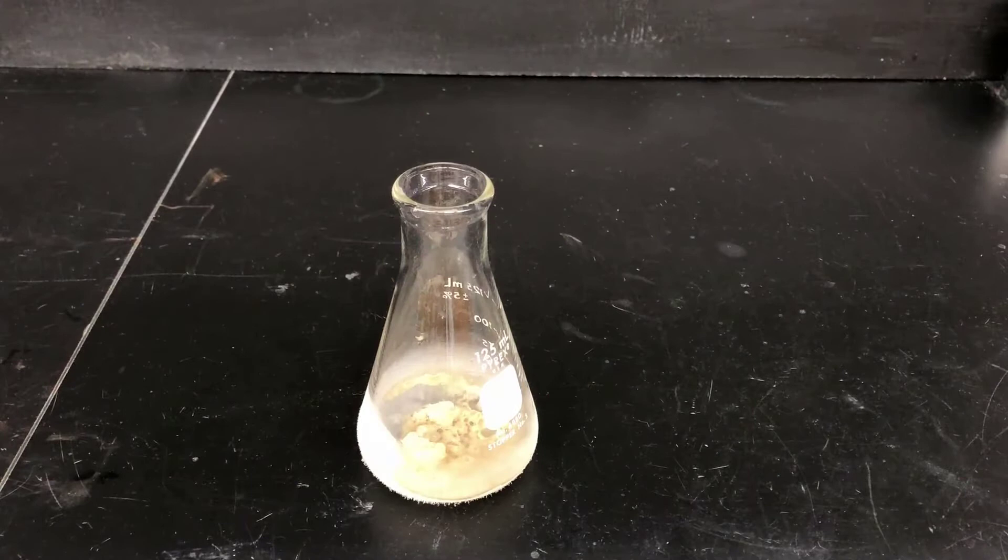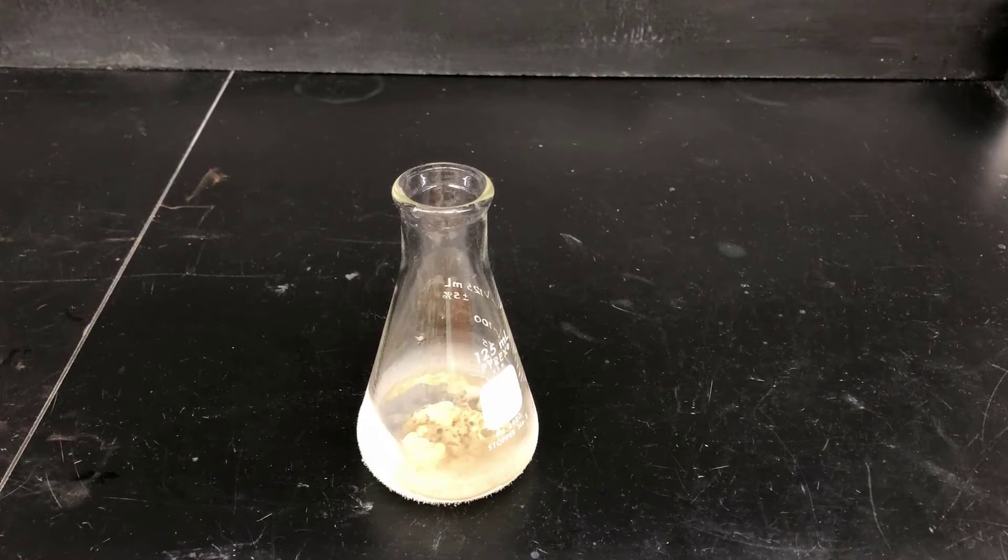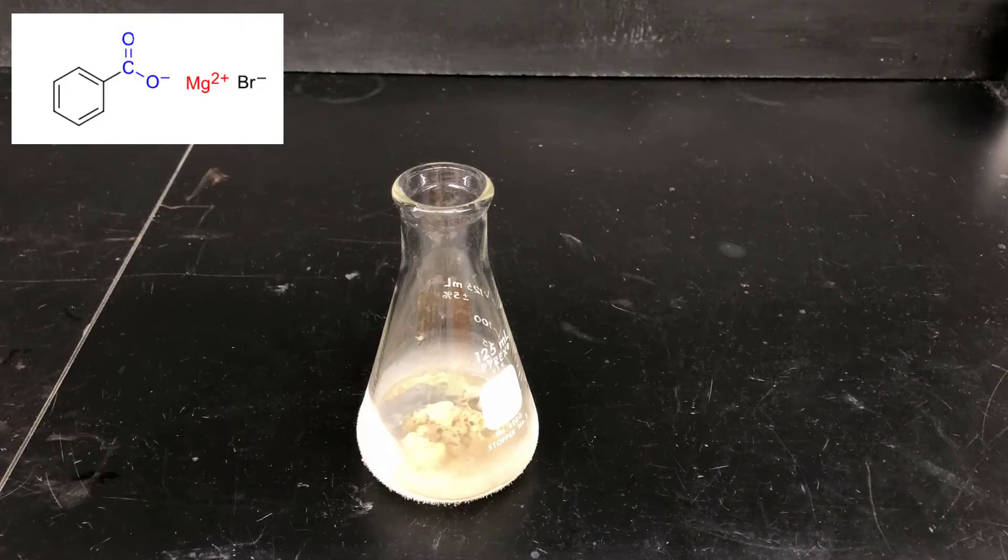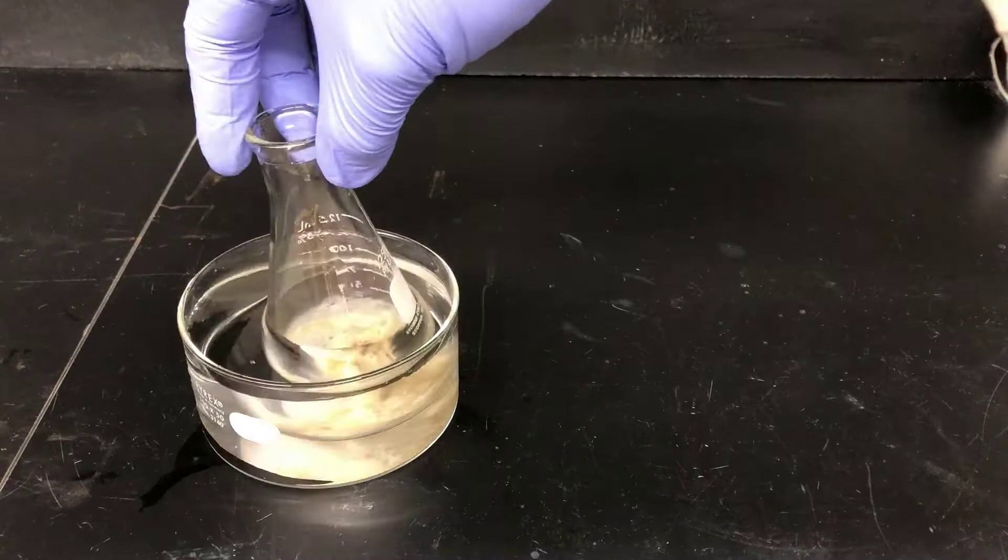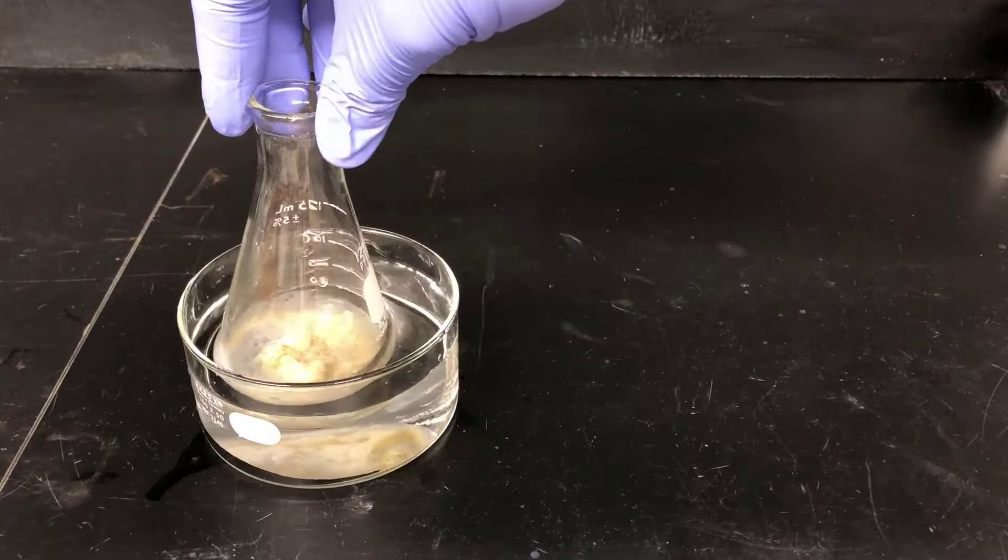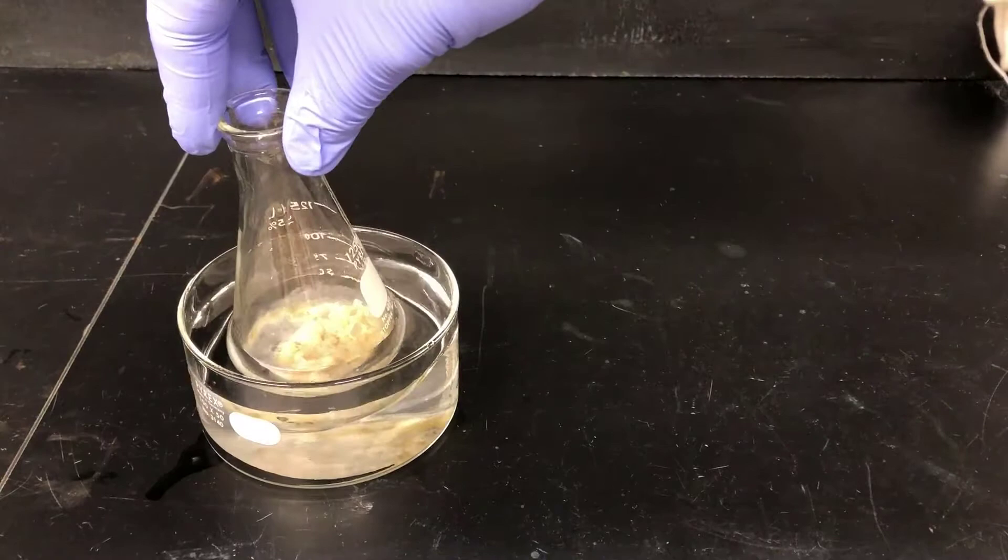At this point, the Grignard reaction is over. The Grignard reagent, phenylmagnesium bromide, has reacted with CO2 to give a benzoate carboxylate salt. Now the reaction mixture is still really cold, and there's still a lot of residual carbon dioxide. I'll take care of both problems by placing the reaction mixture in a room temperature water bath. This will warm up the reaction and accelerate the sublimation of CO2. Once the bubbling has stopped, I'll know I'm done with this step.